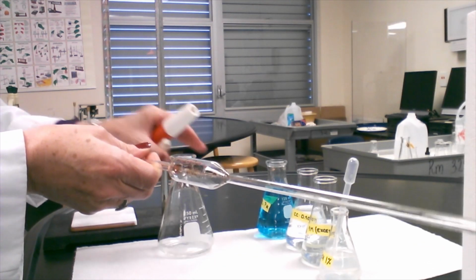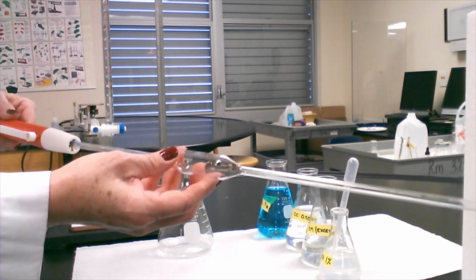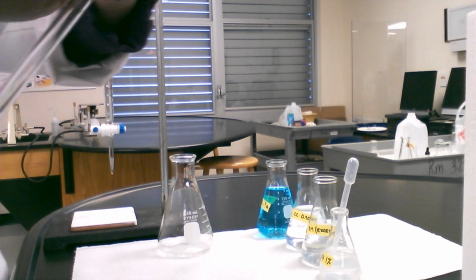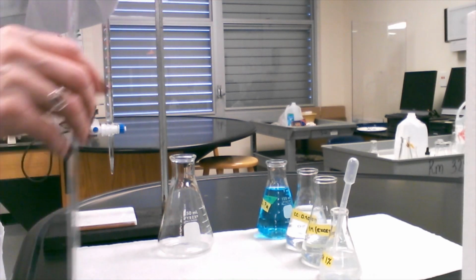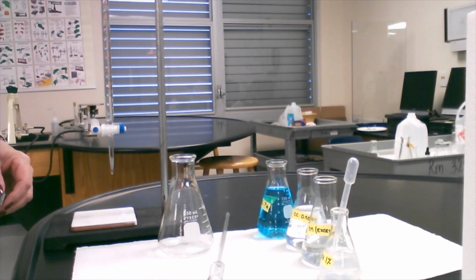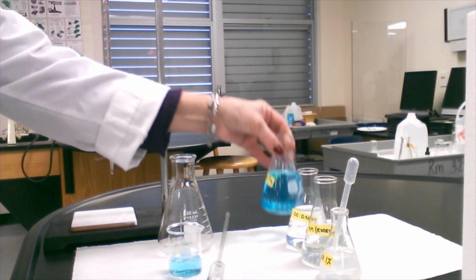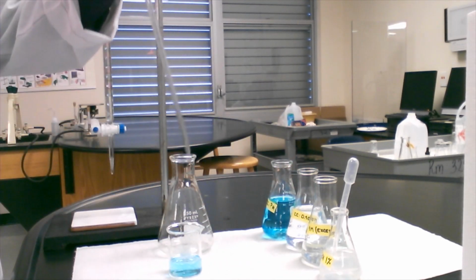of the copper sulfate solution, and we are going to use this volumetric pipette to fill it up to the limit here. Okay, this is the accurate volume that shows that is 25, and we are going to rinse that first. We're going to be sure that we have only the copper sulfate solution there, so I'm going to use a little bit to rinse the pipette. So we are going to use the pipette filler for that.